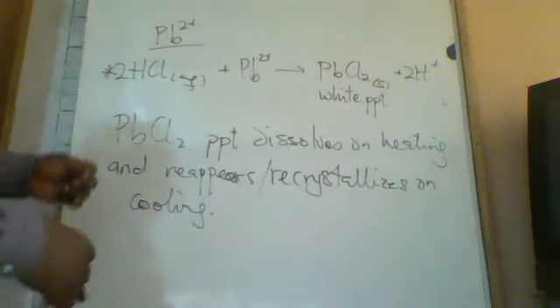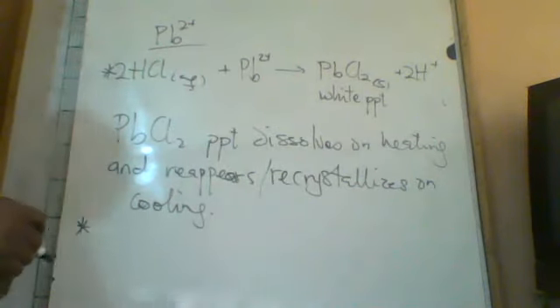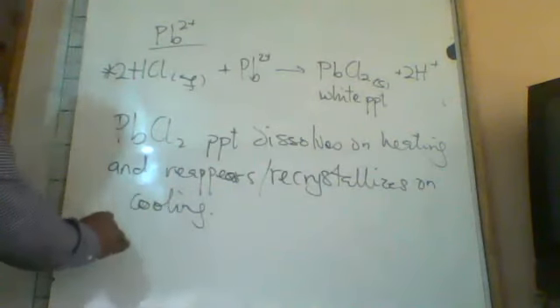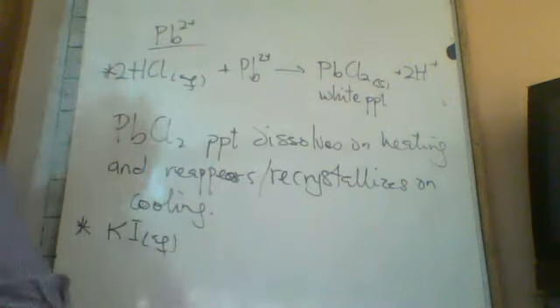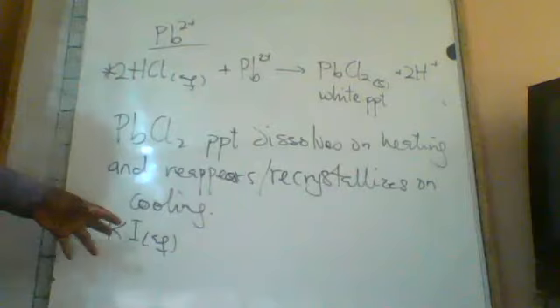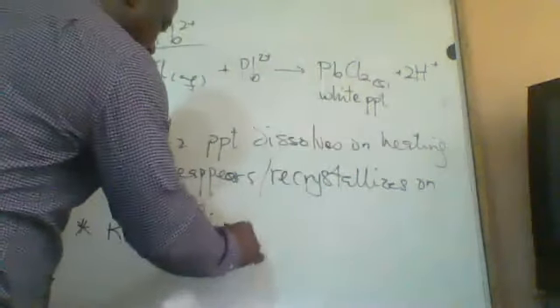That's it. But apart from the HCl, we can use potassium iodide solution. When potassium iodide solution is used, that one is a reaction, of course.